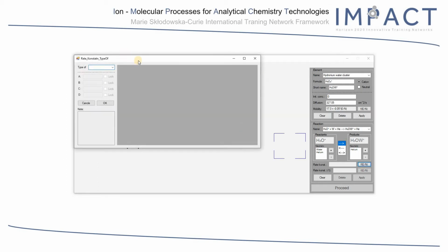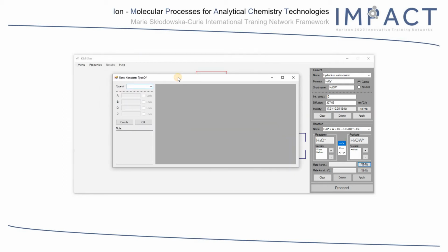The rate constant, similar as in the case of ion mobility, can be a function of electric field. For flow tube simulation we can use a constant value, but for a drift tube simulation we need to choose a proper function. For this tutorial let's just select the constant value.